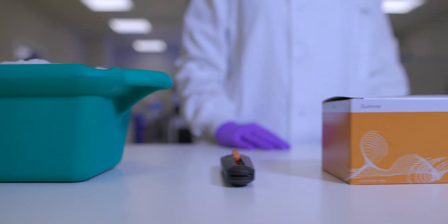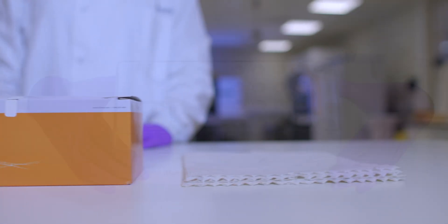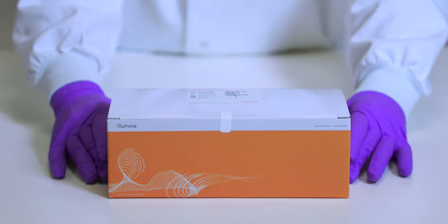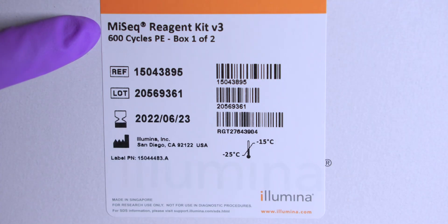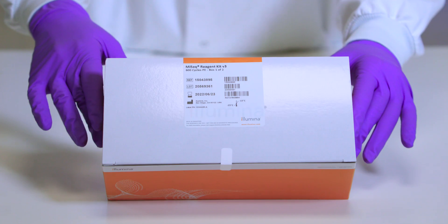In this video, we will show you how to prepare the MiSeq Reagent cartridge prior to sequencing. The reagent cartridge is contained in the MiSeq Reagent box 1 of 2. This box is stored between minus 15 and minus 25 degrees Celsius.